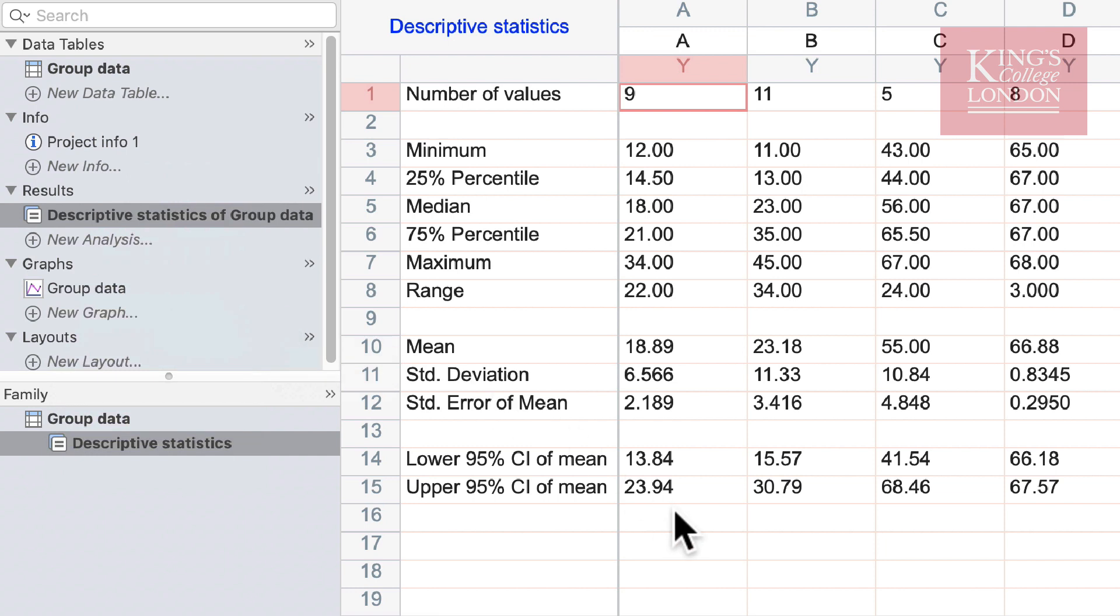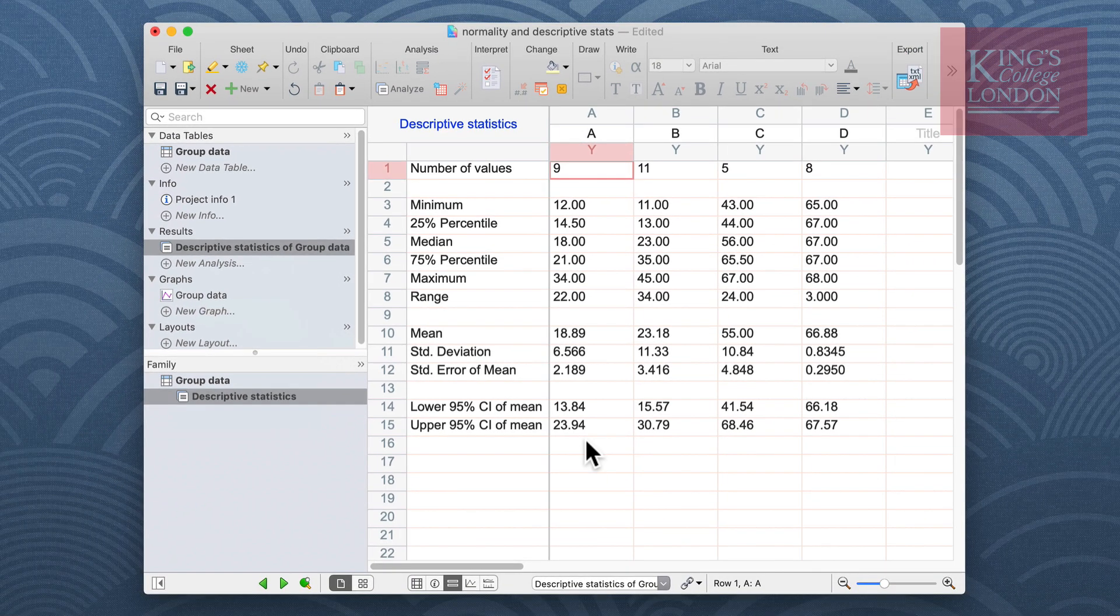The descriptive statistics window is self-explanatory. You can see divided A, B, C and D, the descriptive statistics that we requested. You can see our n number in the top row and then our minimum, percentiles, median, maximum, range etc. down each column. It's easy to see the results of your descriptive statistics for creating tables or other figures outside of Prism.